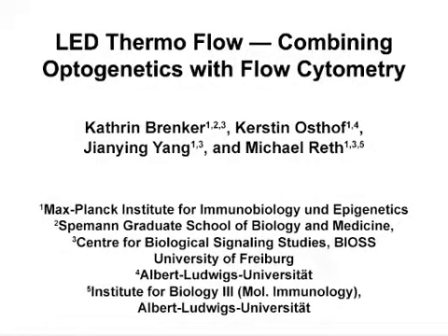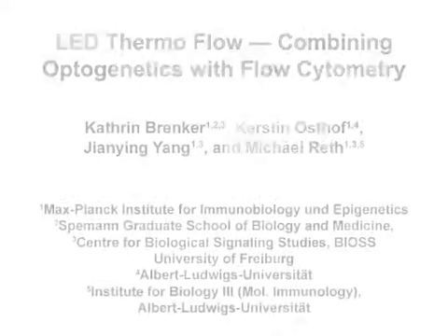The overall goal of this method is to stimulate optically controlled substances during flow cytometric measurements. This novel device can help answer key questions in the field of cell signaling by combining the power of optically controlled substances with flow cytometry. For the first time, optogenetic tools can be characterized and analyzed using flow cytometry. No comparable established method existed until today.